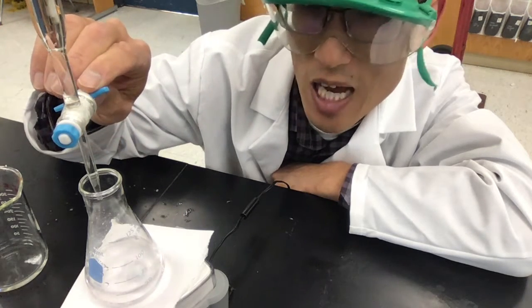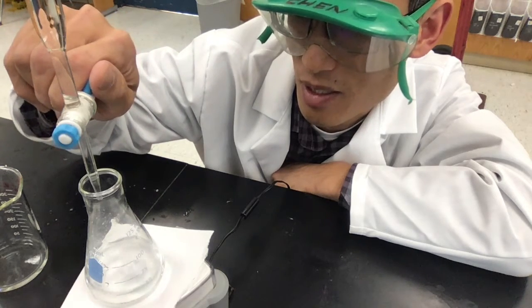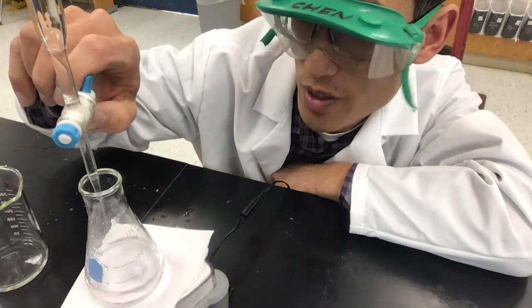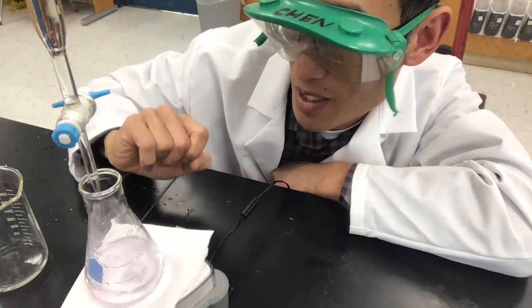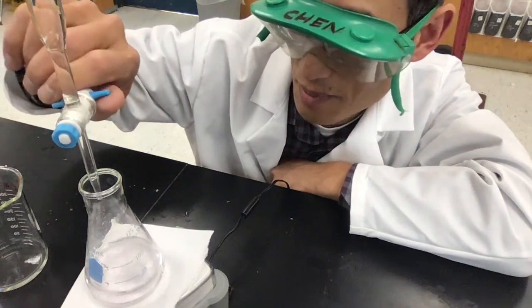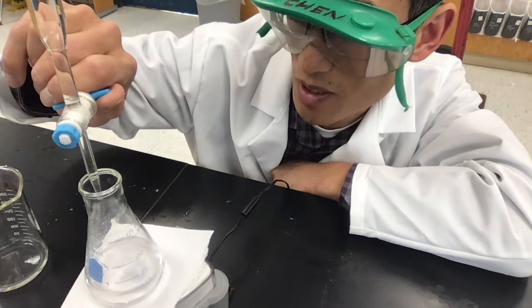What you don't want to have happen is to go too fast and blast through it so that you get it to turn all the way pink. I'll show you that just so you can see it. Okay, so you get faint pink. See, that's faint pink. Is it going to disappear? Yeah, it's going to disappear a little bit, but that's okay. We can say that that's approximately where it's going to change.